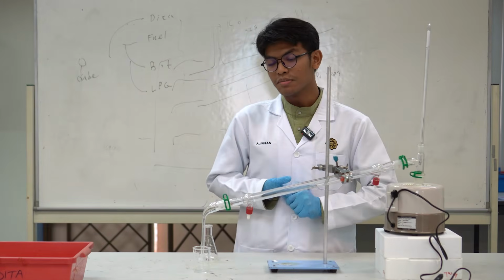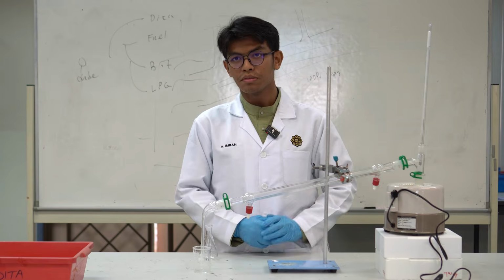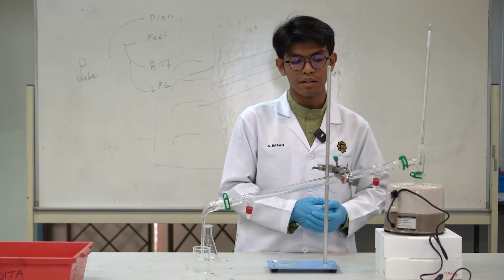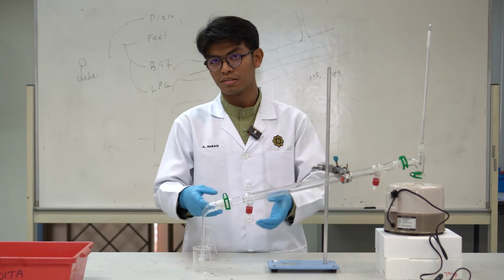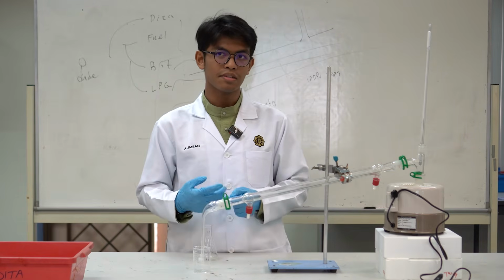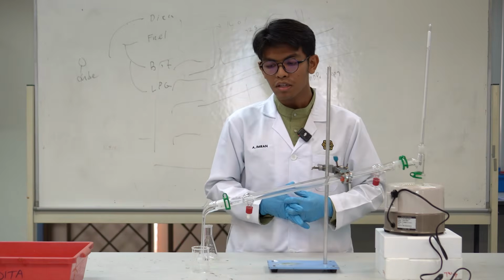And the third precaution step is, as we all know, we are going to insert cold water inside this condensation column, which is important to condense the pure substance. Usually during the startup of the condensation process, or the water input, there are bubbles inside the inlet of the condensation column. So we need to remove the bubbles to ensure that the efficiency is maximized and the condensation is smooth, and to collect pure substance with full utility.